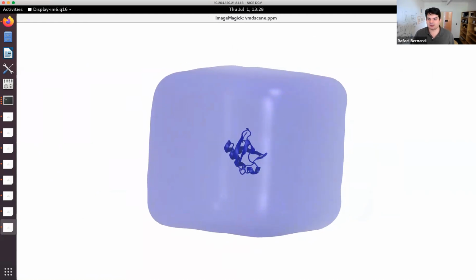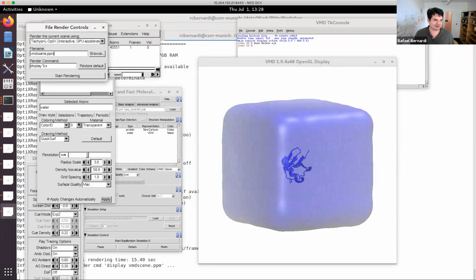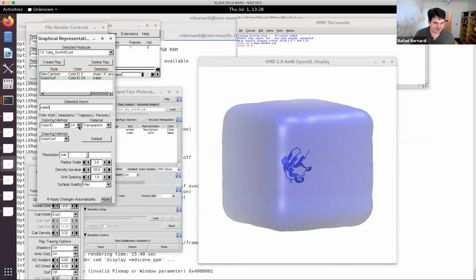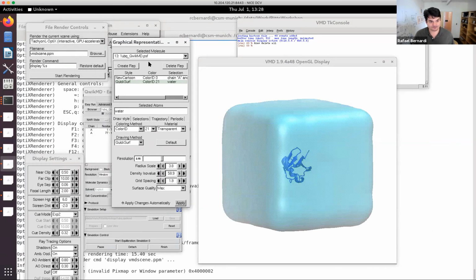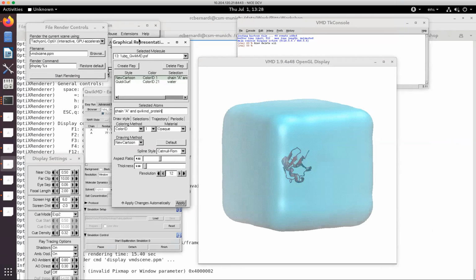But you can change it. You can change the color of the blue. That's like a tone of the blue. You want something light, like a lighter tone of blue. That's something that I typically do. Let's say you come here, find the best blue. That's typically how I use it. Then I can make the color of the protein also complementary, to get more contrast.